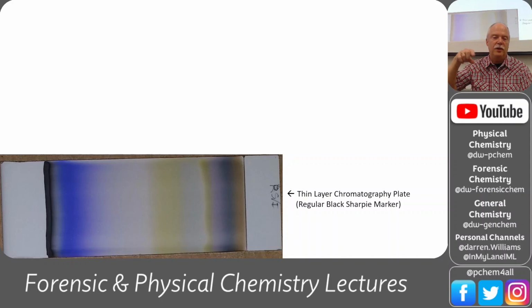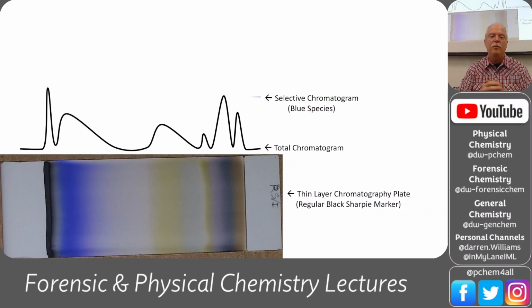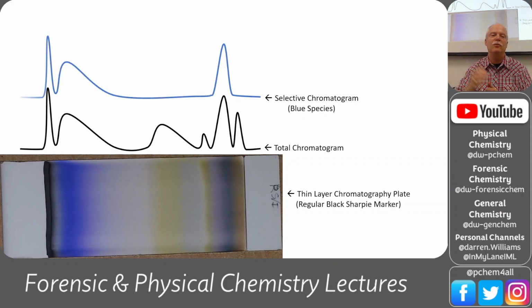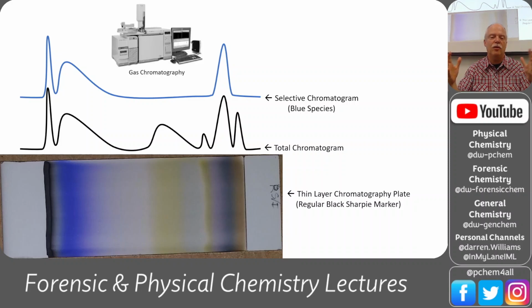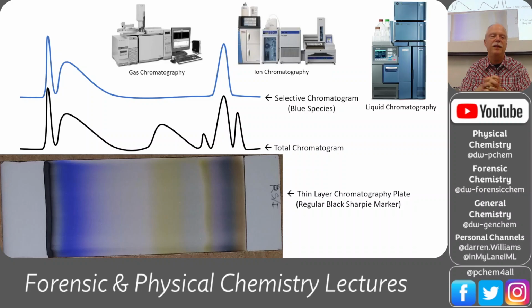If you were to draw a total chromatogram on here, every one of those compounds would be a peak. And the more spread out it is, the more broad the peak. But if you had a selective chromatogram, like just the blue species, this is what it would look like. The bottom one would be what we call the total chromatogram, and then the blue one would be the species-specific chromatogram.